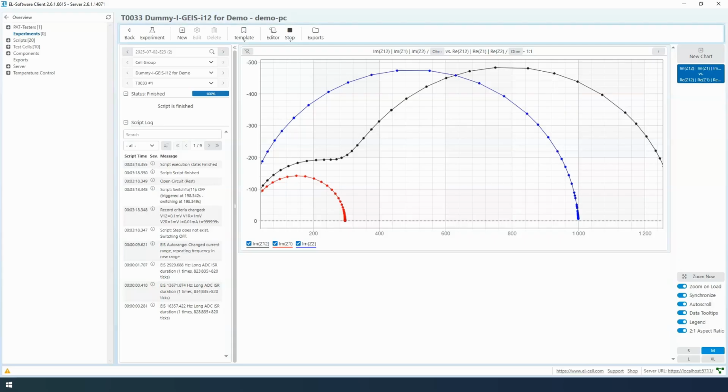The navigation bar at the top has been updated, and the options for displaying graphs have been moved to the bottom right. I will cover these features in more detail later. In the left-hand section, the selection of the displayed data has changed. There are now more options here, and the possibility to switch directly to other experiments. However, the most significant changes have been made on the right-hand side.